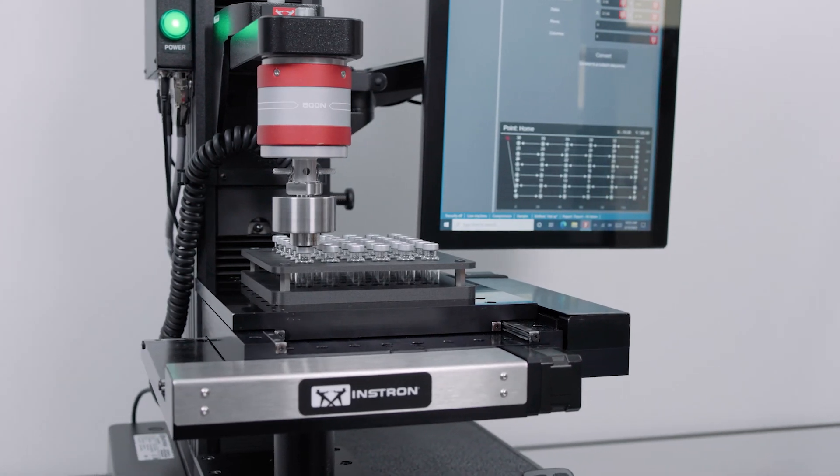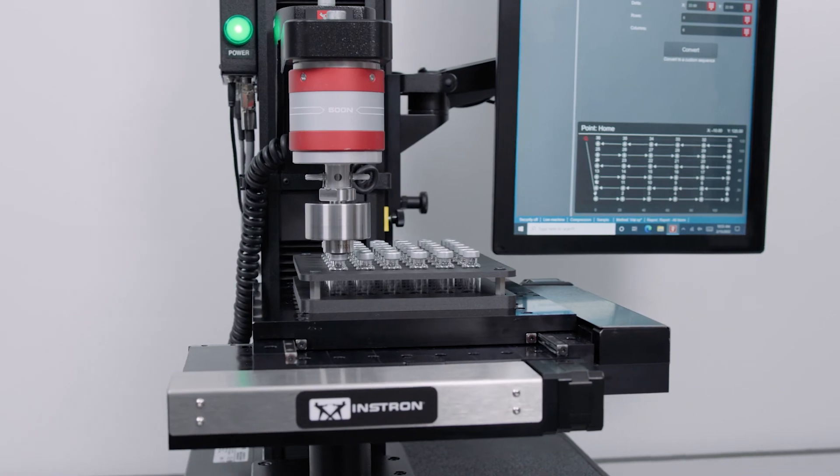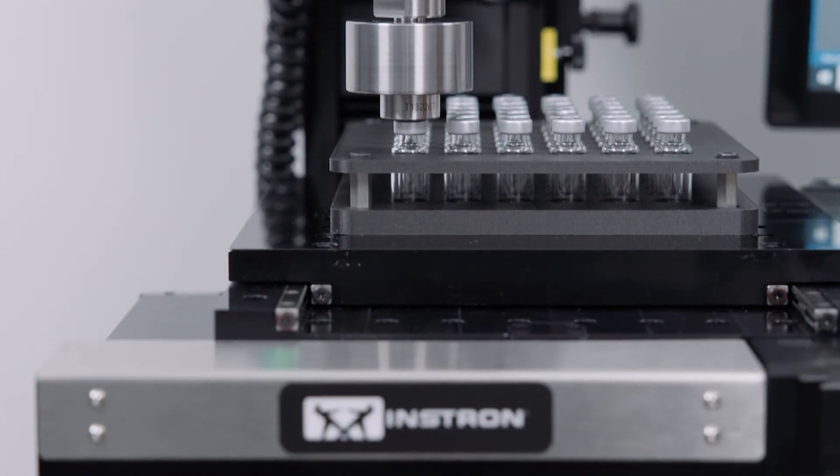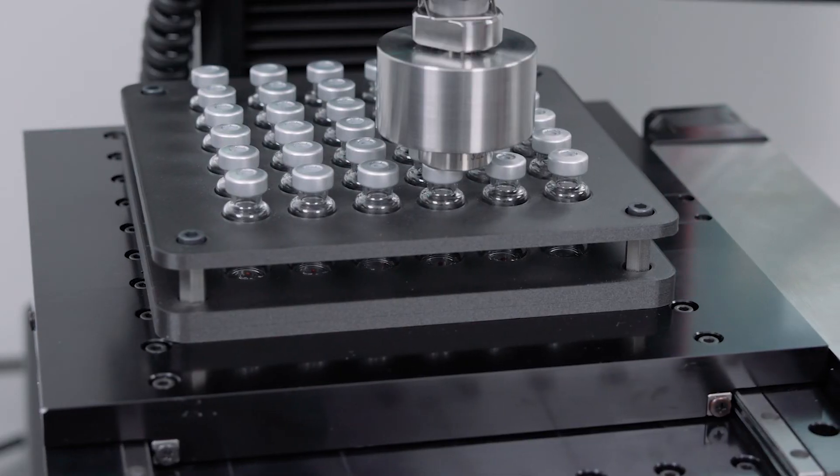For labs stretched thin by a limited number of operators or increasing workloads, an automated XY stage can make a big difference to not only efficiency but also repeatability.